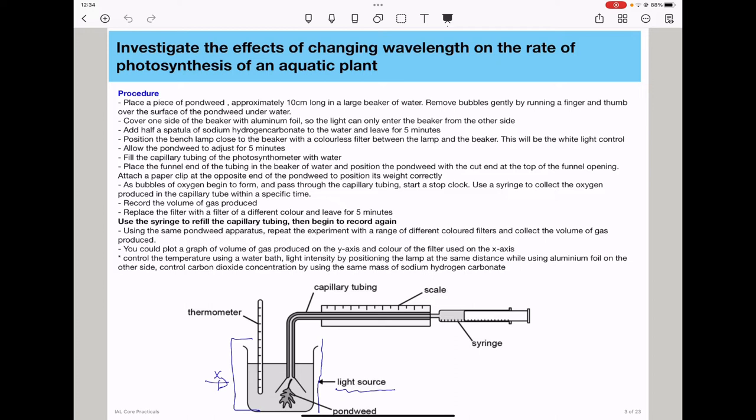And then you will leave for 5 minutes for the plant to adjust, and then you can begin to measure your results. So use the syringe to refill the capillary tubing and then begin to record again. In the next step, using the same pondweed apparatus, repeat the experiment with a range of different colored filters and collect the volume of gas produced.